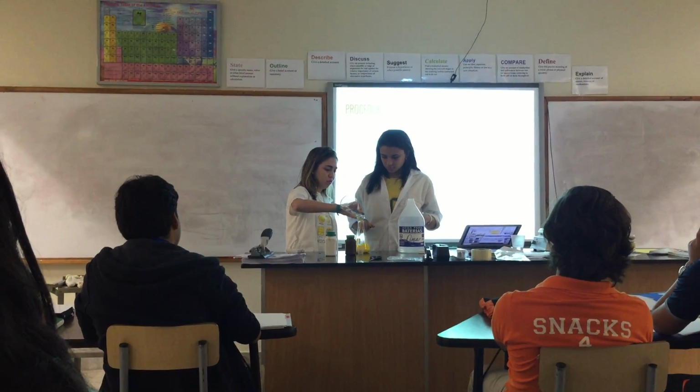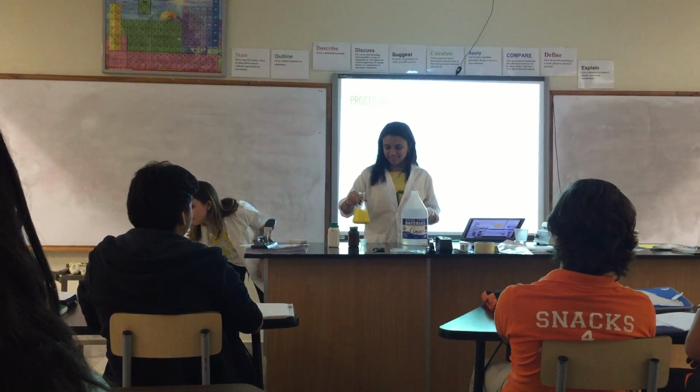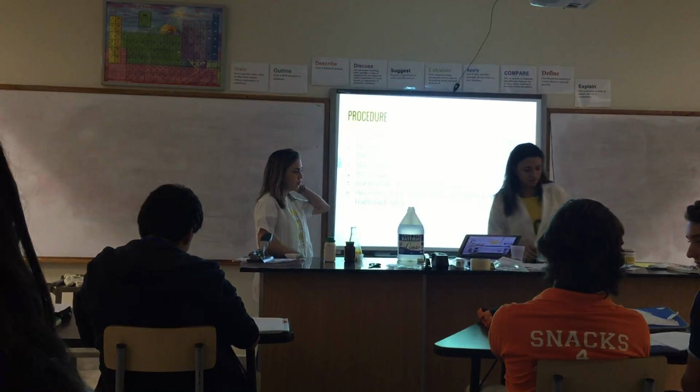You'll see how it changes color. Golden rain. So that reaction happened.